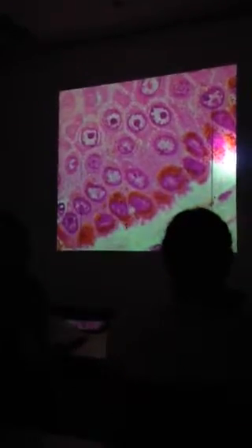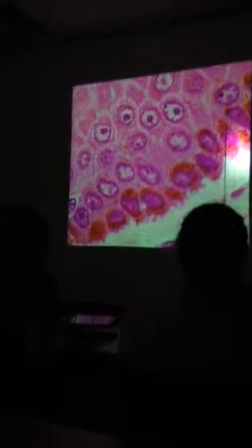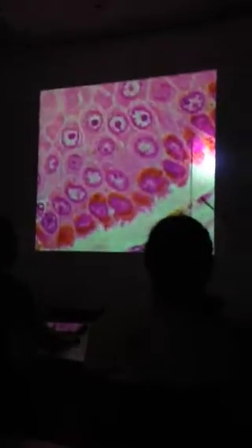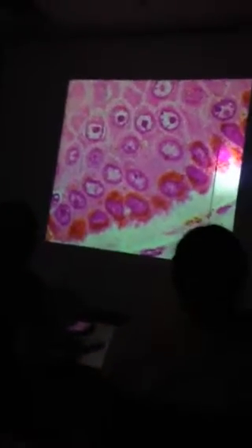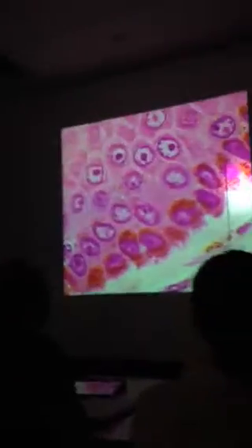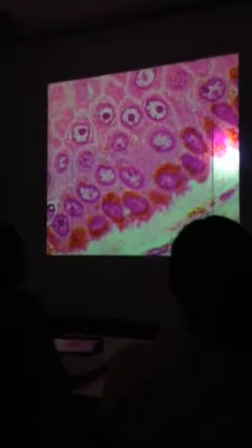This is a high mag of pigmented epidermis, or pigmented skin. You see a little bit of dermis down here. So what's this cell most likely? Fibroblasts. Right. These are probably fibroblasts down here. And then what would these pink things be? Dense, irregular. Well, there'd be collagen fibers, right? Making up the dense, irregular connective tissue. See, this is the thing. When you learn histology, you've got to go low mag, high mag, everything in between. You've got to learn cellular structure, subcellular structure, and organs.